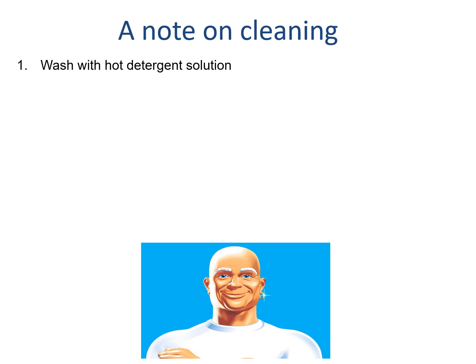When we clean, we need to remove both organic and inorganic contaminants. Organic contaminants are nonpolar, and so they require a detergent that also has nonpolar components, since like dissolves like. Inorganic contaminants tend to be polar and require DI water. Sometimes salts that have +2 or greater charges have limited solubility and actually need to be removed by nitric acid, which makes them more soluble.